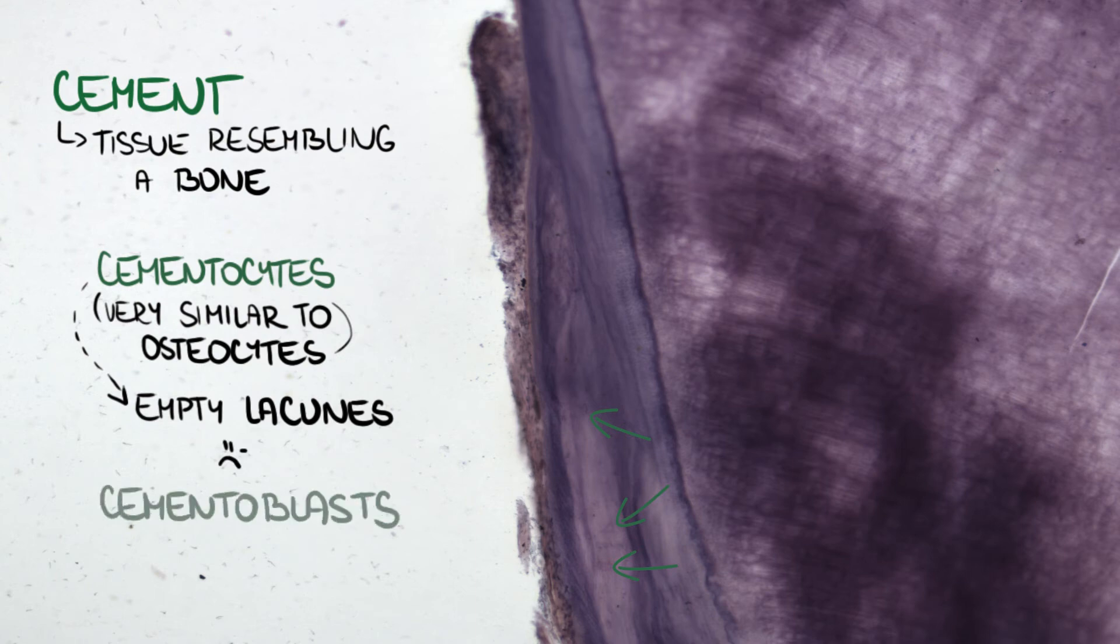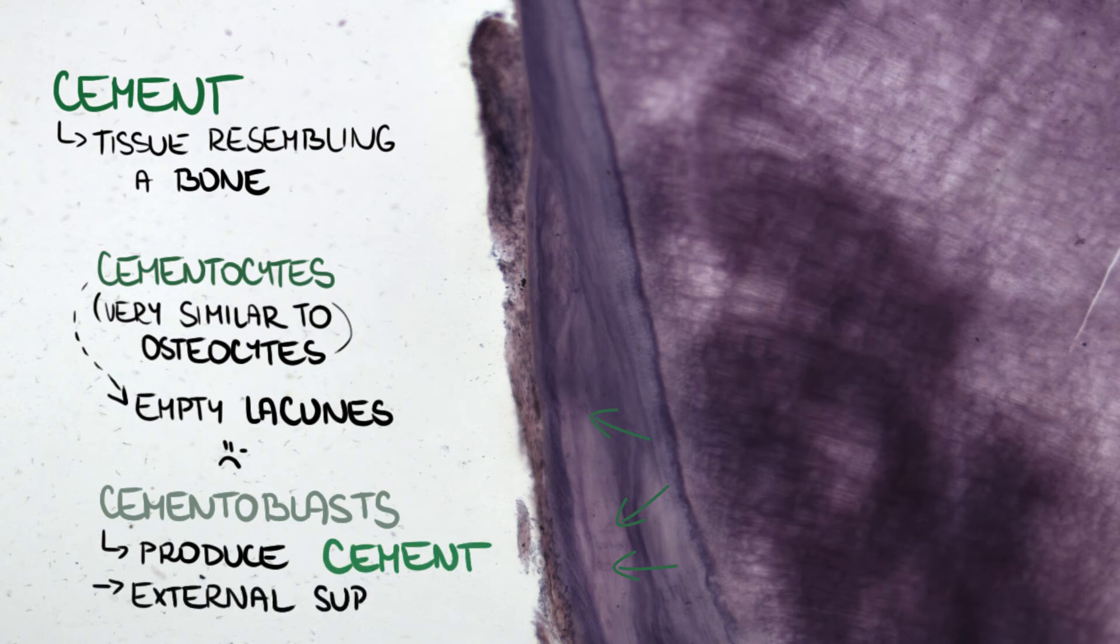Cementoblasts are cells producing cement and can be found on its external surface. Unfortunately we cannot see them in our slide. They are subsequently embedded in the cement substance and transform into cementocytes.